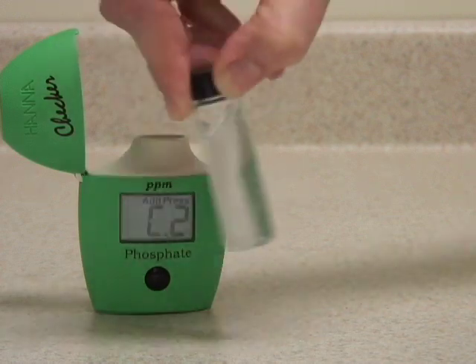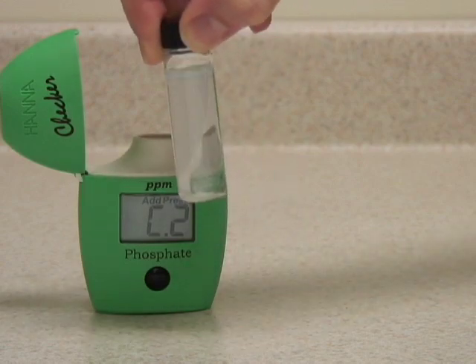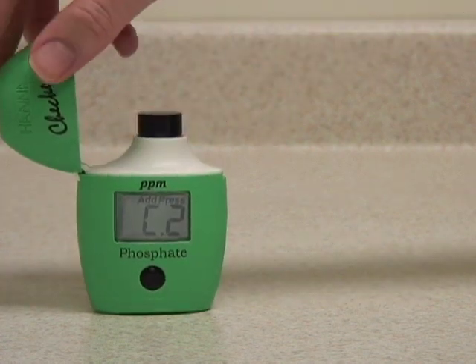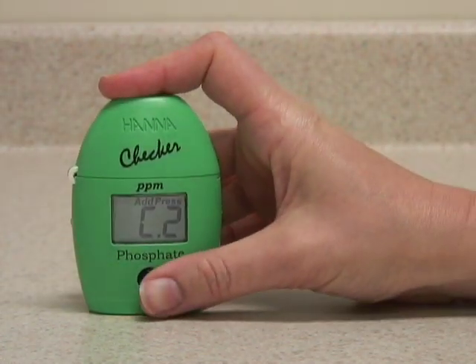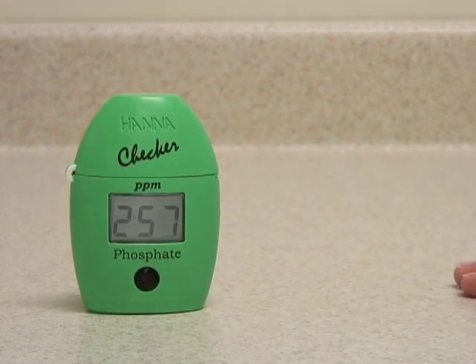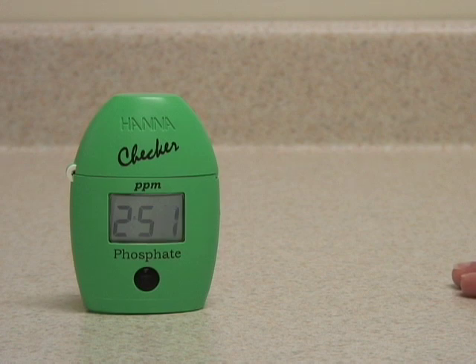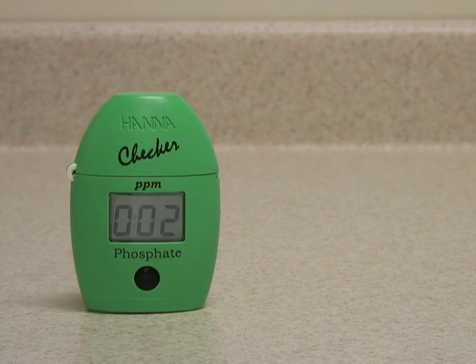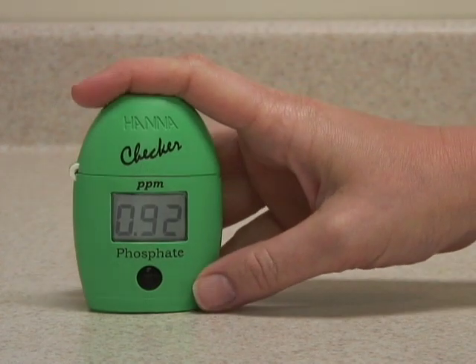The sample begins to turn blue as it reacts with the phosphate in the water. Insert the vial back in the meter, close the lid, and press and hold the button to activate the timer function. The meter will count down three minutes for the reaction to take place. After three minutes, it will automatically analyze the sample and display the concentration of phosphate in parts per million.